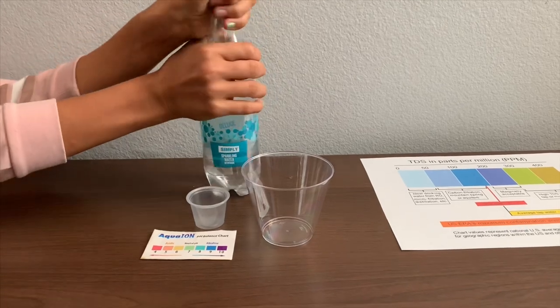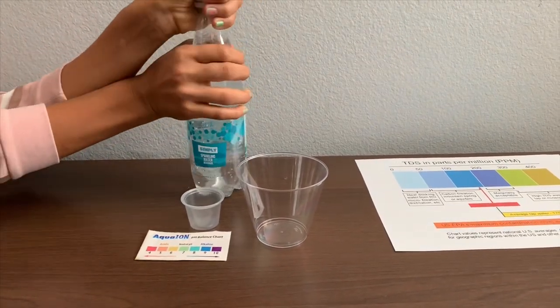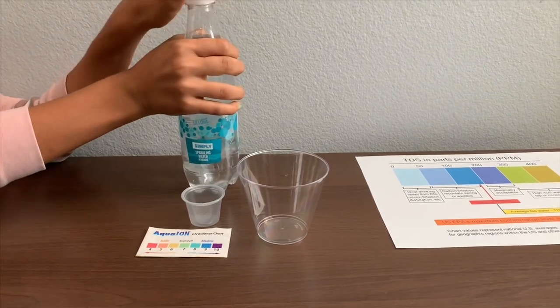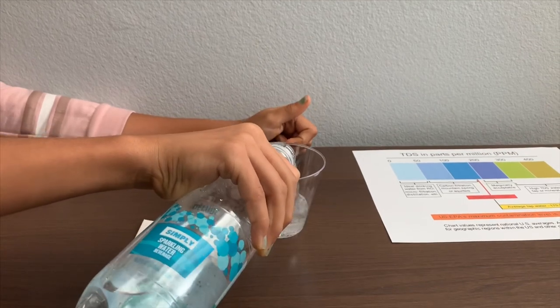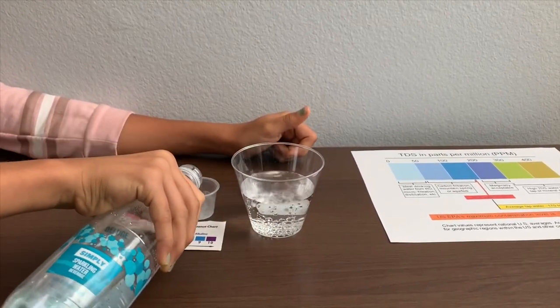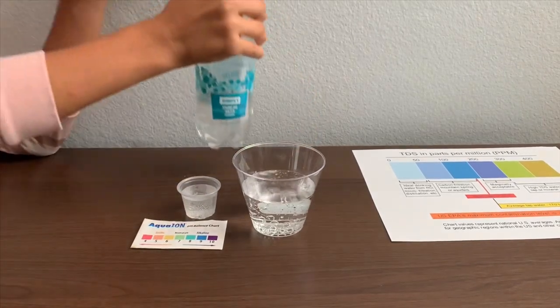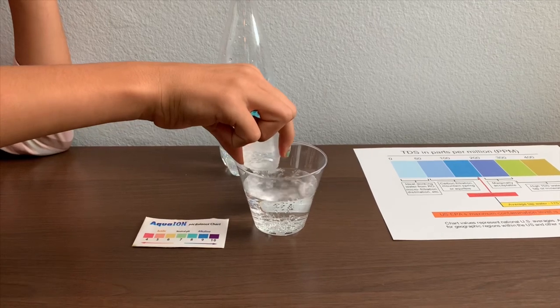Let's pour some water in. We're going to test the TDS level first, then we'll test the pH level. This is too much for the pH cup, so let's pour some back into the TDS cup.